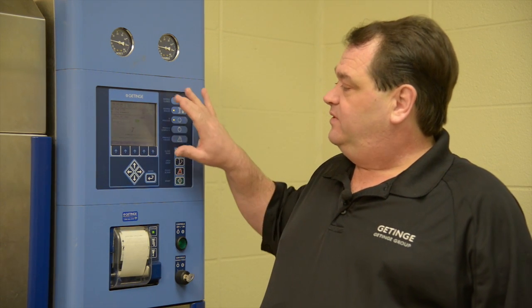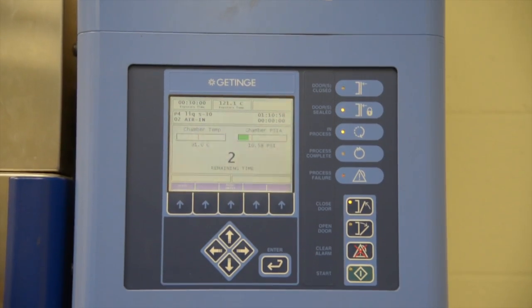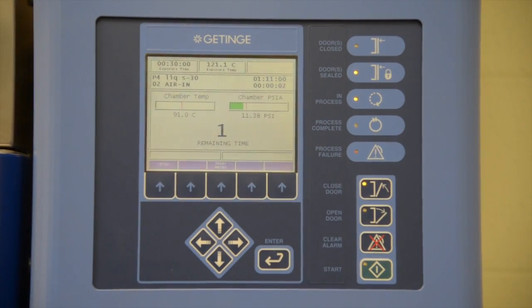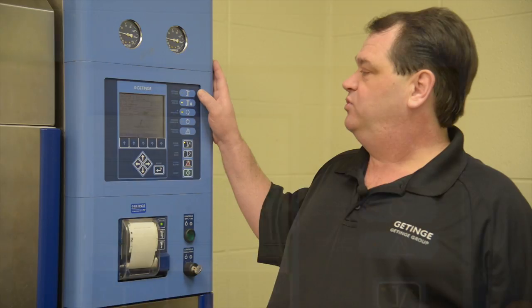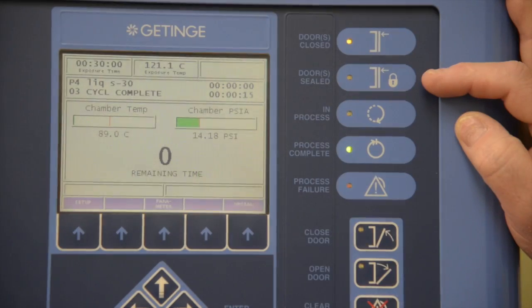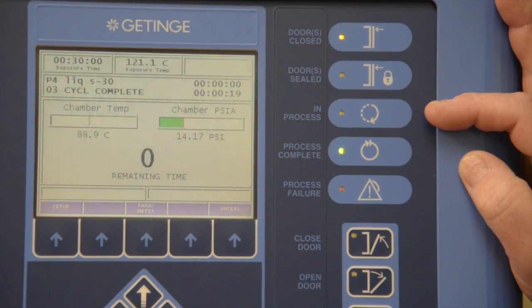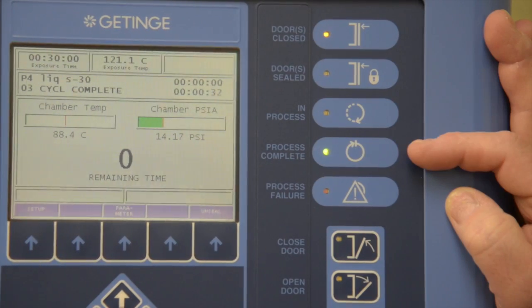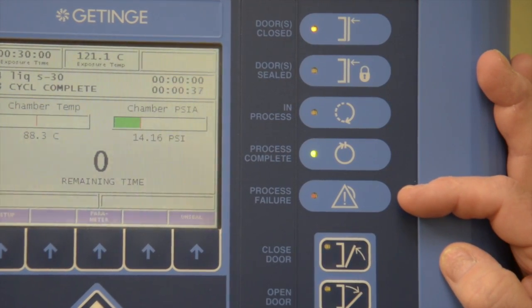We also have the display panel which gives us information on the machine as it's running. We also have the indicator lights which show us if the door is closed, if the door is sealed, if the sterilizer is in process, if the process is complete, or if the process failed, either due to an alarm or a manual abort.